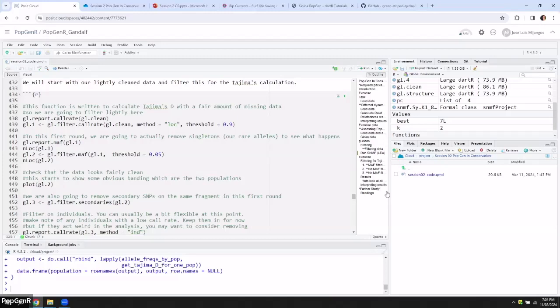That's just a minor question, but you filter for the individuals very late, and I think you throw away a bit of loci by doing that as a last step. If you do it first, get rid of the really bad individuals, that could save you some of the loci. This is running on the GL clean, so we already did that first filter step.